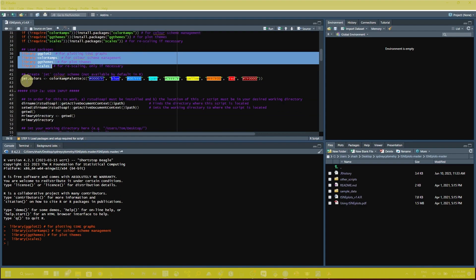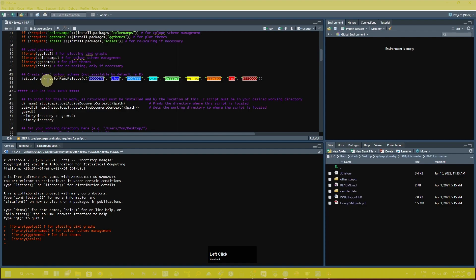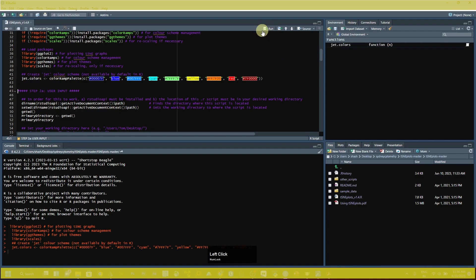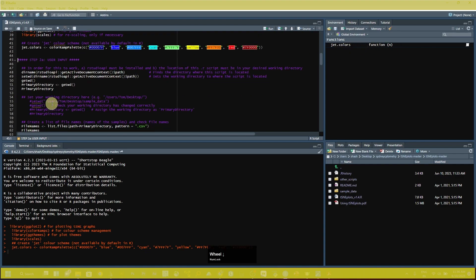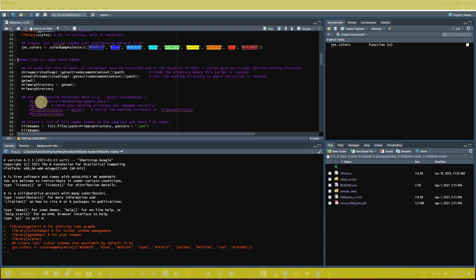The next step is to assign the colors — select that line and click Run. In the global environment you can see the z_colors function is now present. The next step is the user input section, where you have to assign your folder path. The first step is to select the directory you are going to use for your analysis.